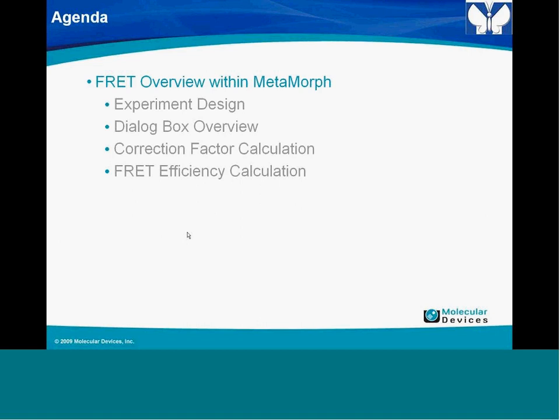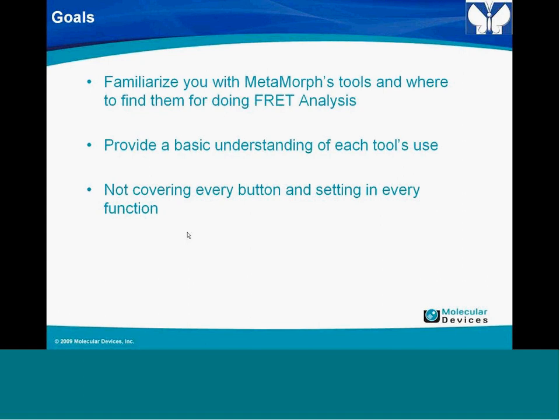The goals for this webinar will be just to get you familiar with the tools that are available within MetaMorph to do FRET analysis. We'll provide a basic understanding for each tool's use, but we won't necessarily go over every button or setting within all these functions that we have.